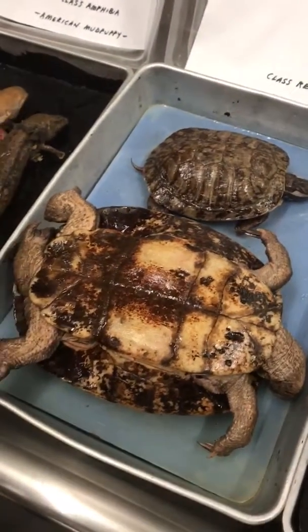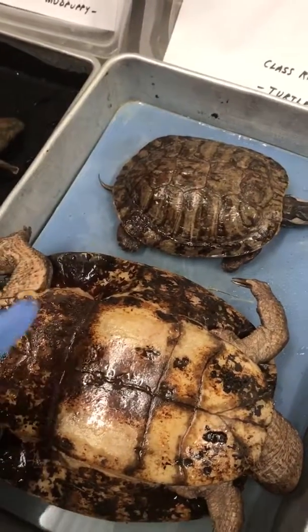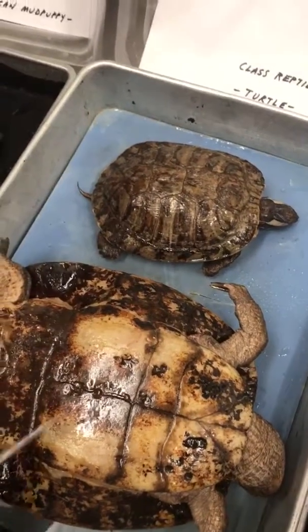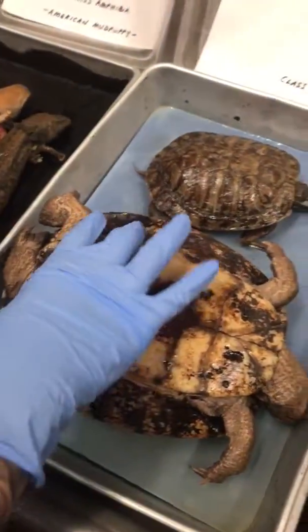Good. So the top of the shell is going to be the carapace. Think of the top of a car. And then the bottom of the shell, that's going to be the plastron. And then if you want to open it.